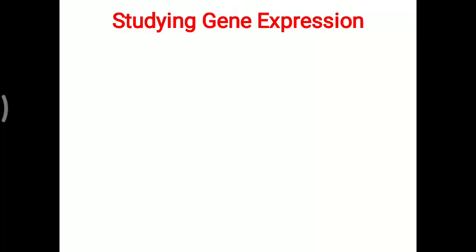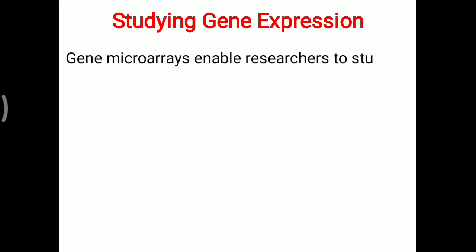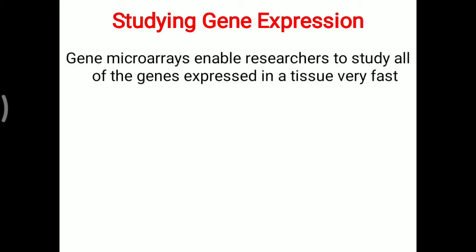Today's topic is gene expression: how we can study particular gene expression in a tissue, which is explained in this video. There is one technique, the gene microarray, that enables researchers to study all of the genes, whether expressed or not, in a tissue very fast.